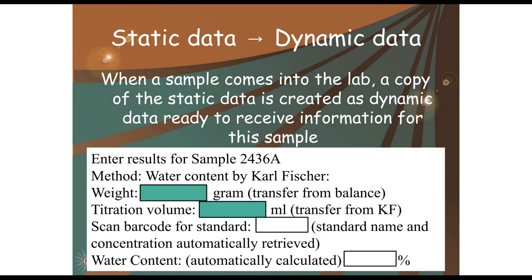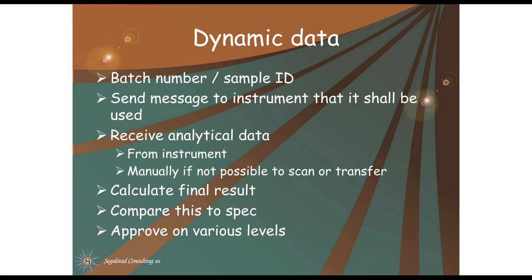We do the titration, and the volume is entered by the Karl Fischer instrument, and LIMS knows all about that instrument as well. LIMS will then calculate the water content for the sample based on the calculation formula we have entered. There is no need to use a calculator or Excel, LIMS does it. And as we have validated the method and its calculations, we know that the calculation is correct. All the metadata is available, and we have the following ALCOA: attributable, legible, contemporaneous, original, accurate. And the plus factors follow also as we back data up from LIMS so that it is complete, consistent, durable, and available.